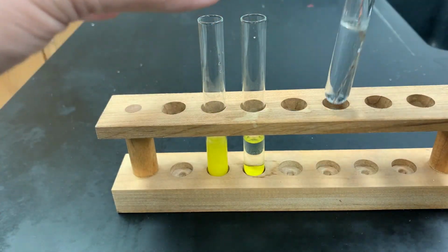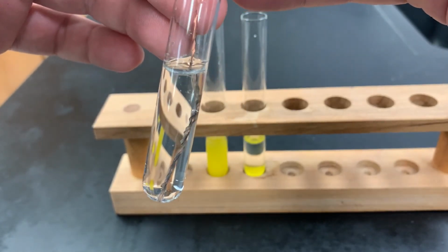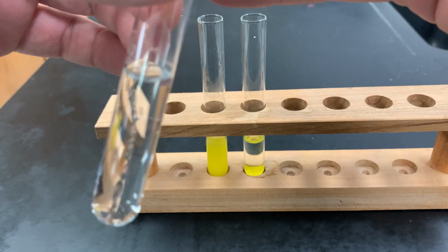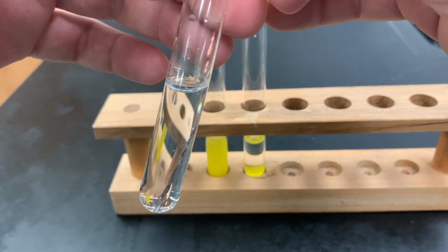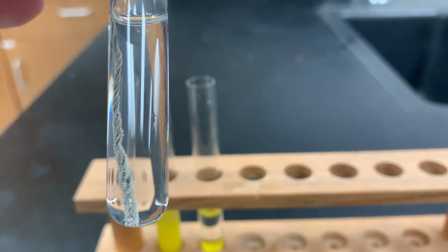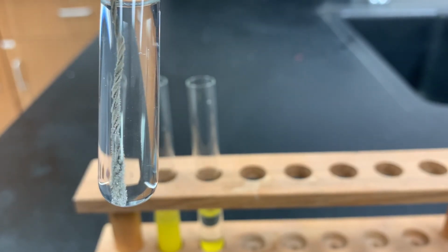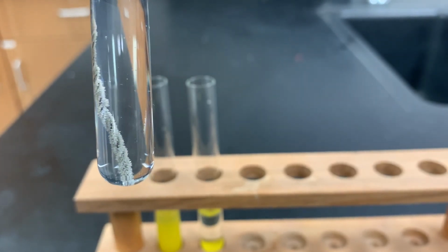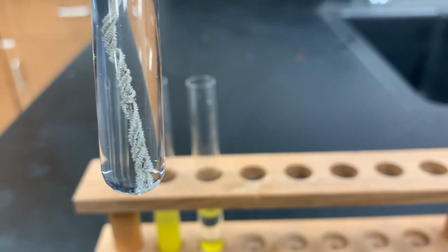If we check back in on the copper in the silver nitrate, you can see that the copper is starting to become a little bit discolored as silver deposits are forming on it. And we'll check back in with that later and see how it ends up. If we check back in, we can see that little crystals of silver metal have started to form all over the outside of this copper wire as we have performed this single replacement reaction. You can actually see those little crystals of silver all over the wire.